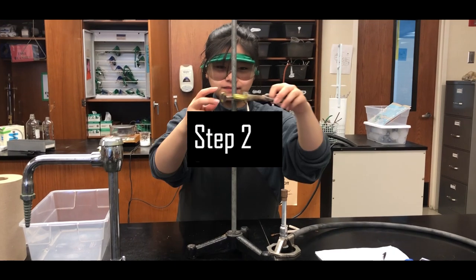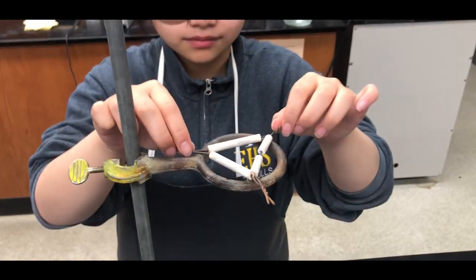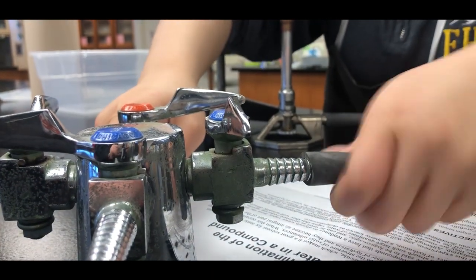Step 2 is to set up the lab as depicted. Place the clay triangle on top of the ring, then place the burner under and connect the burner to the gas source.